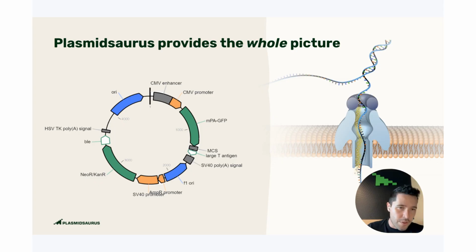Because if you did it without the motor protein sitting there, it would zip through at something like 1 million bases per second, which is too fast for the base calling algorithms to make sense of the raw data squiggle. And so the helicase as an enzyme was designed, specifically evolved, to get through tricky secondary structures. It actually just breezes right through even tough ITRs. And like I said earlier, there's no read length limit.